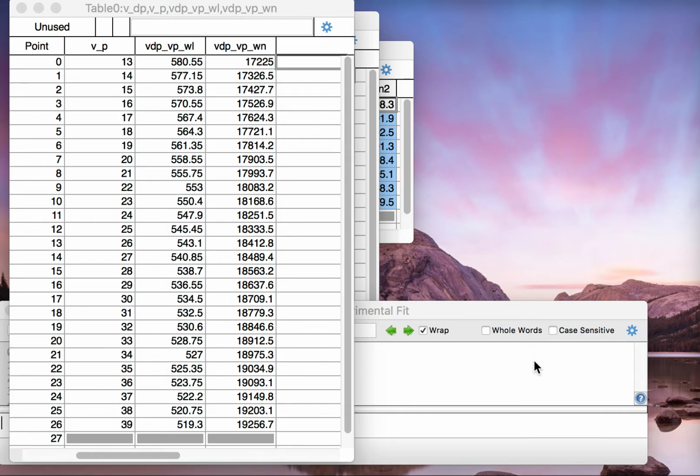This screencast will be a description of how to take iodine spectra, UV-Vis spectra from a physical chemistry lab, and fit it using what's called a multivariate fit to get 5 parameters at once. The other typical way the ground and excited state parameters are fit is to use a Birge-Sponer plot, which works very reasonably, except you're always working with a portion of the data.